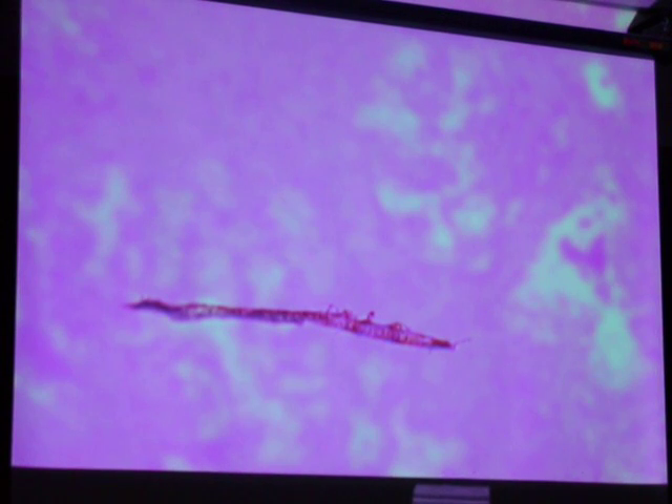So that line at the bottom — would it be a prostatic concretion as well? No. If I focus on it, it's out of the plane of the tissue, so it's just something on there.